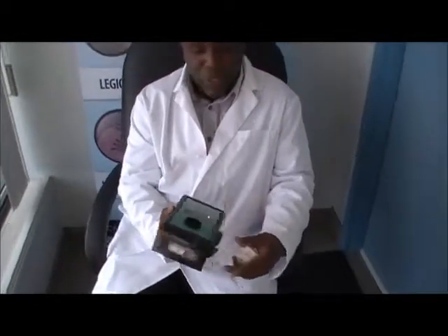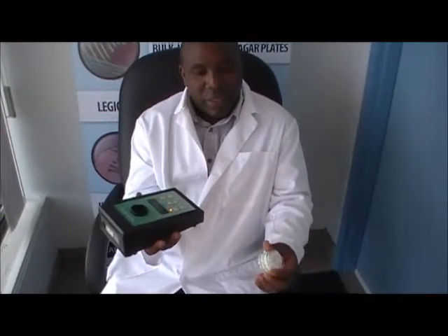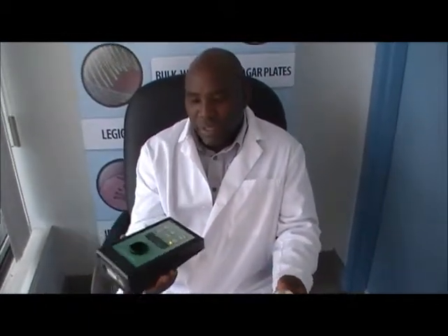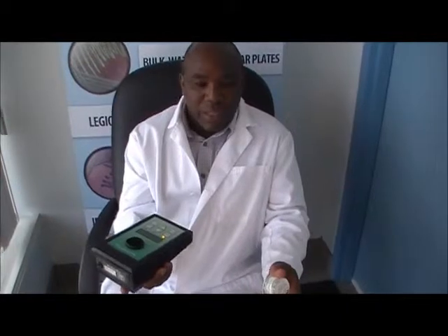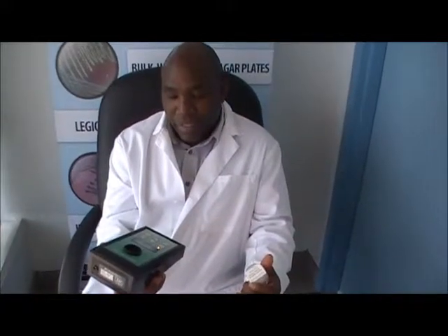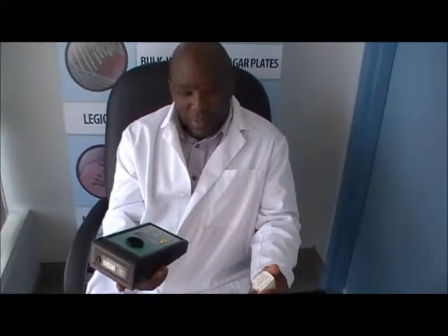You can take the sample while you are holding the pump, or you can use a tripod. You hook the pump on the tripod, and that way you can be doing other things while the pump is taking the sample. And that's it — easy, simple, and brilliant.